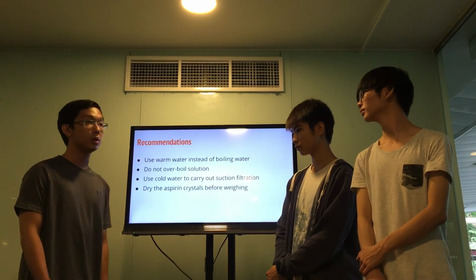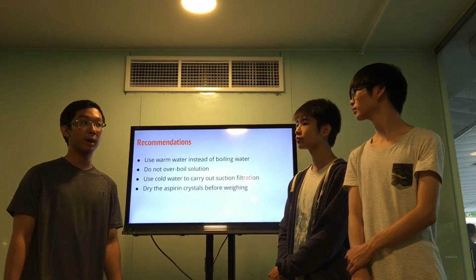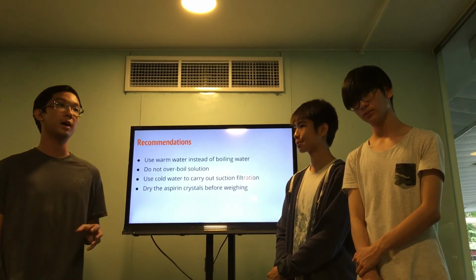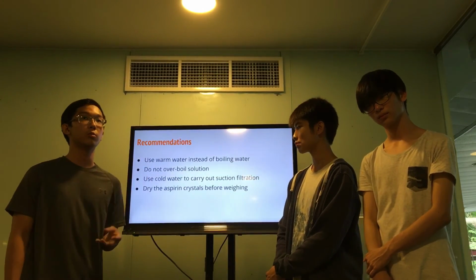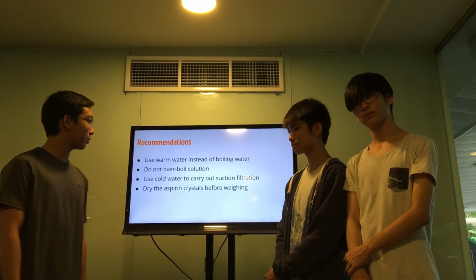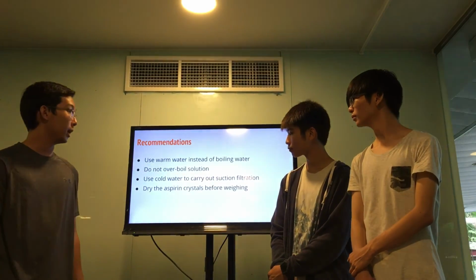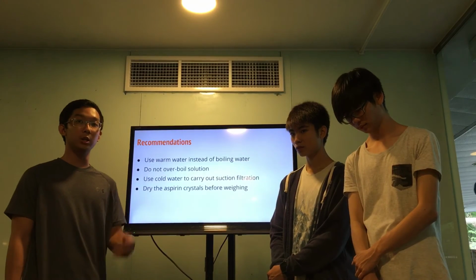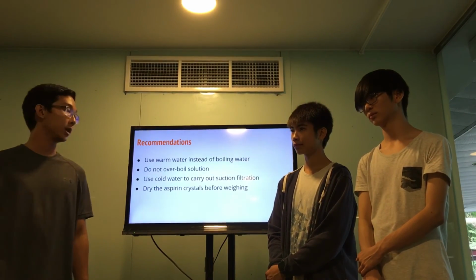And cold water could have been used in suction filtration, as by using cold water, you will make sure the aspirin does not stick to the Buchner funnel. If cold water is not used and the aspirin sticks to the Buchner funnel, then the percentage yield would be lower. And aspirin crystals must be dried in a desiccator before weighing, as if it's not dry properly, the aspirin could have water droplets in it and could affect the weight.